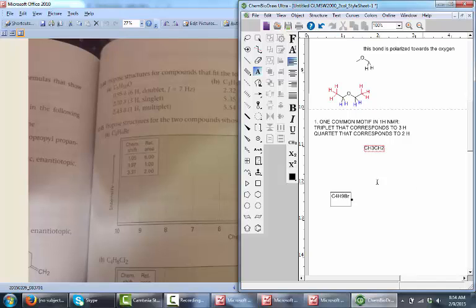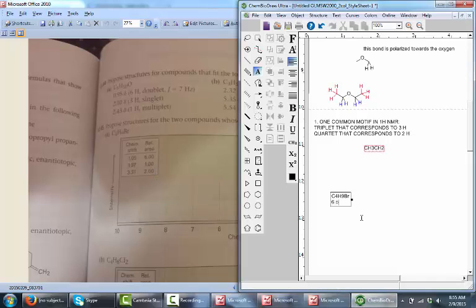C4H9Br. Okay. Now the first thing, let's look at this spectrum and see what we can figure out. And this one has another useful motif. Let's start with the areas here. So we have 9 protons, that's the H9, and the relative area shows 6 to 1 to 2. So that means right away we have 6 of one type of proton, 1 of another type, and 2 of a third type. That's the first thing.